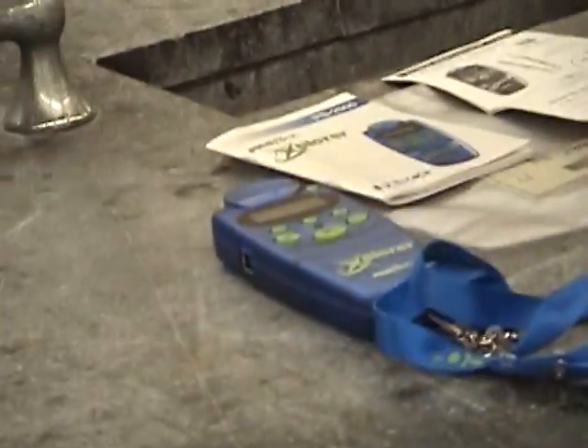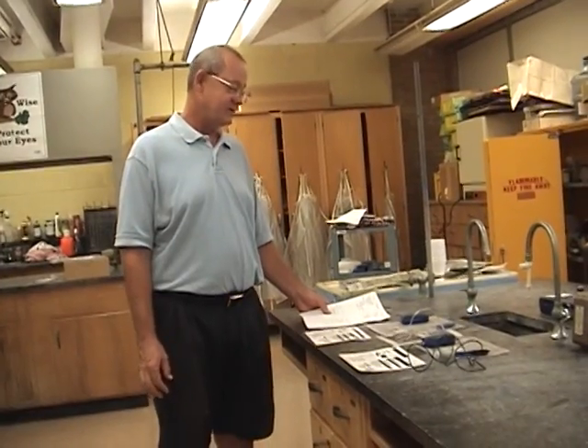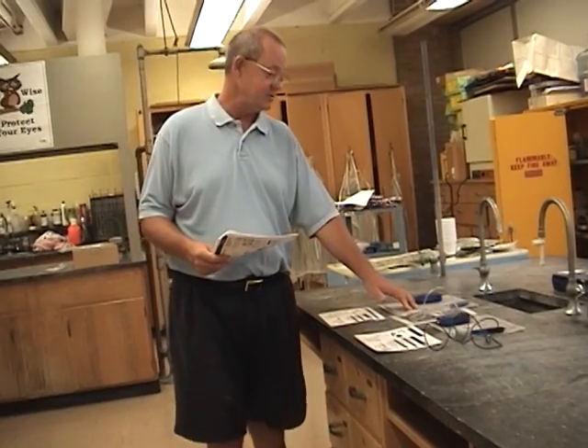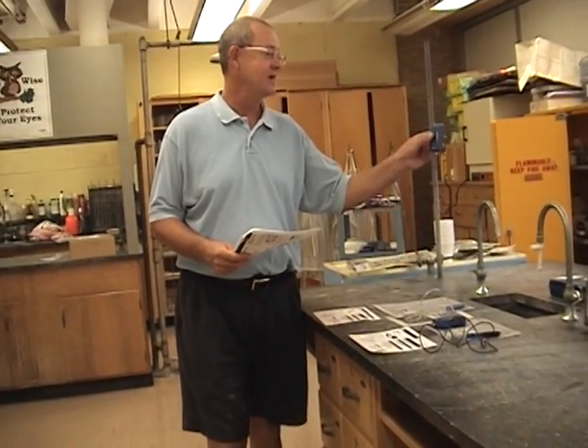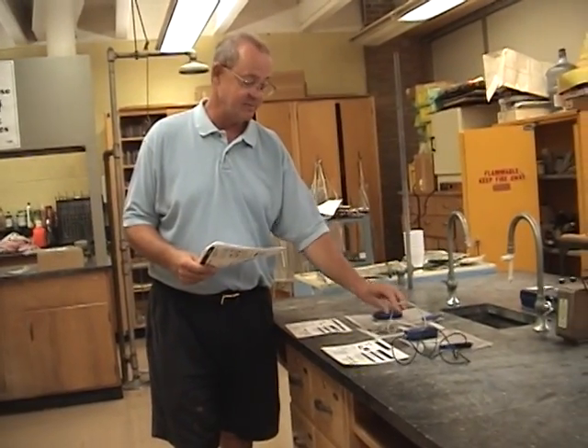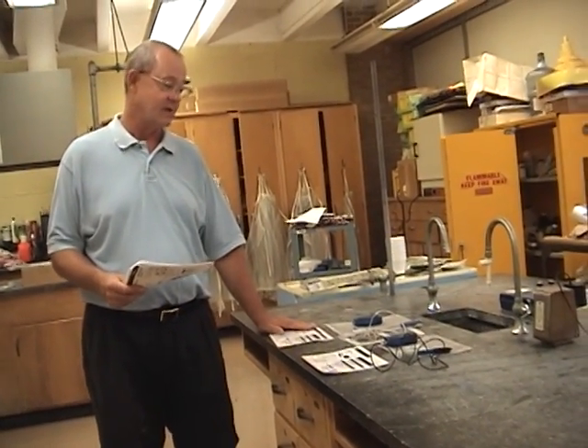I'll take you now over to Drawer 5. Drawer 5 contains two different packs. The first pack is your temperature sensor pack, and this is actually the temperature sensor. Here's the thermometer that will plug into that temperature sensor. That's all stored in a plastic pack, along with two accompanying instruction cards that you'll want to take a look at.